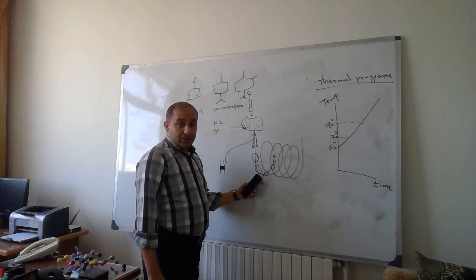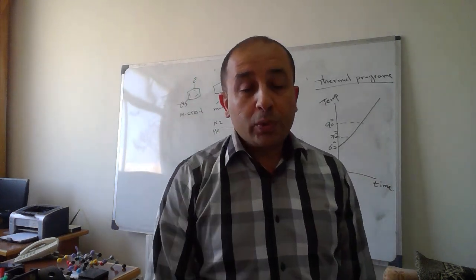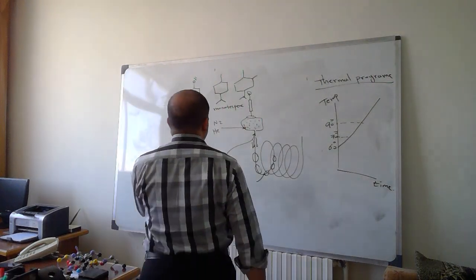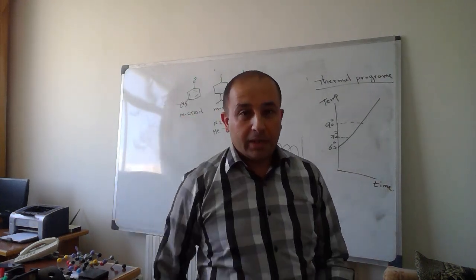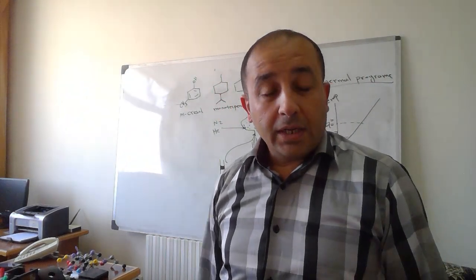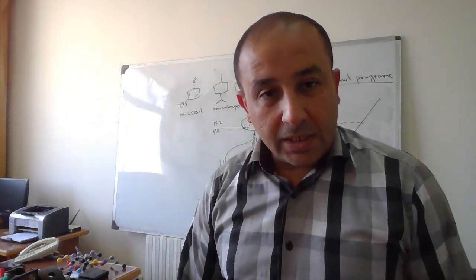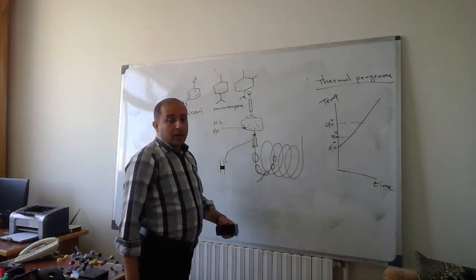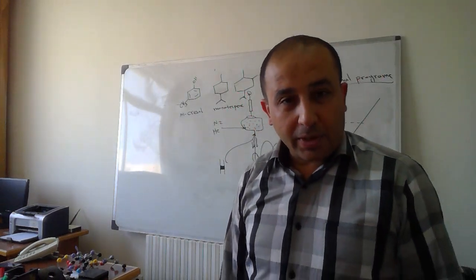Now, the retention inside the lipophilic silica will contribute significantly, in this case, in separating these compounds. So the one with the methyl group should be more lipophilic, so it will stay longer in the lipophilic silica. Now in GC we have silica as the lipophilic phase, which is methyl silica or phenyl silica. Okay? So hydrophobic will stay longer. But the major contributor of separation is the thermal programming.